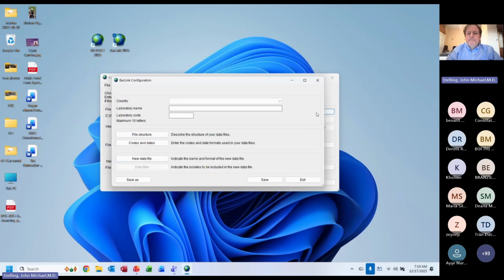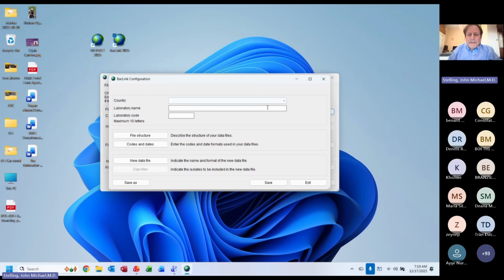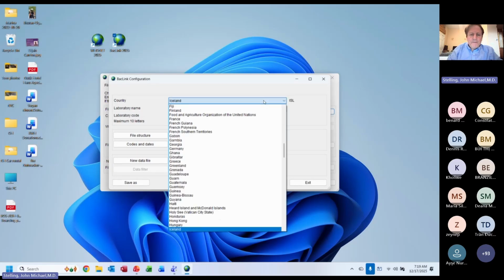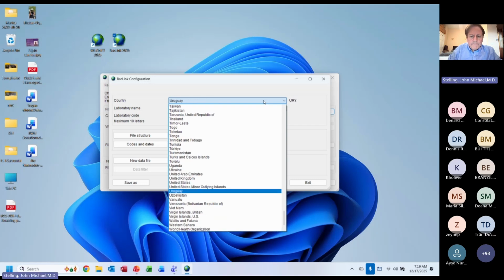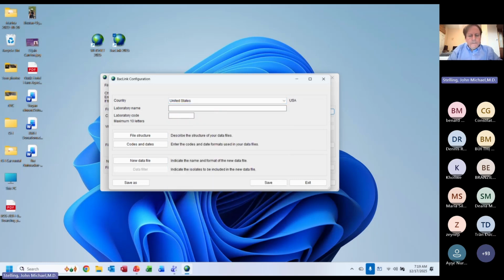New format. BacLink has a few simple questions to get started. What country are you in? I'm going to say United States. There it is. And let me call this BacLink webinar 2. I'll call this BW2.